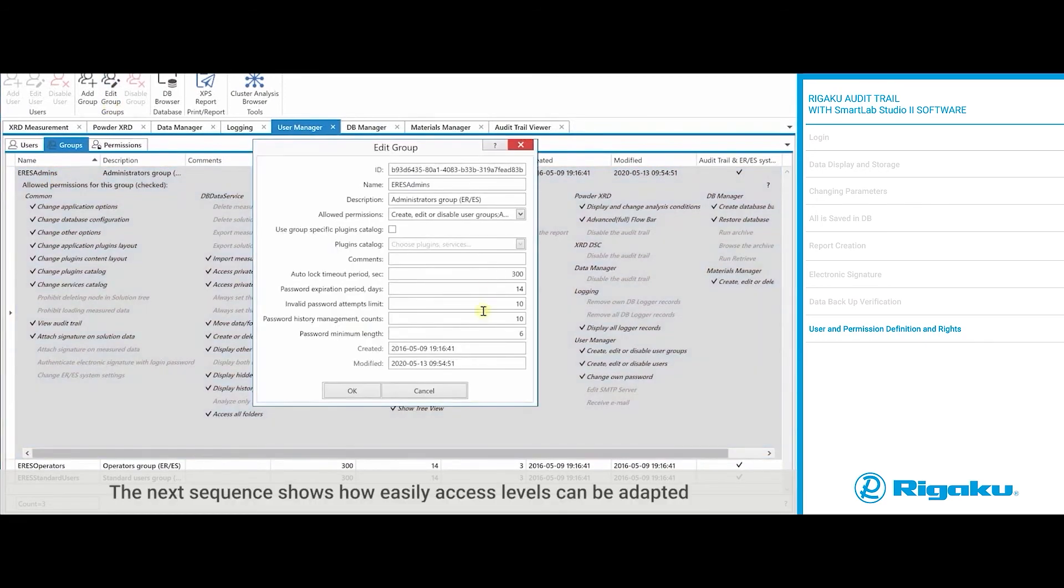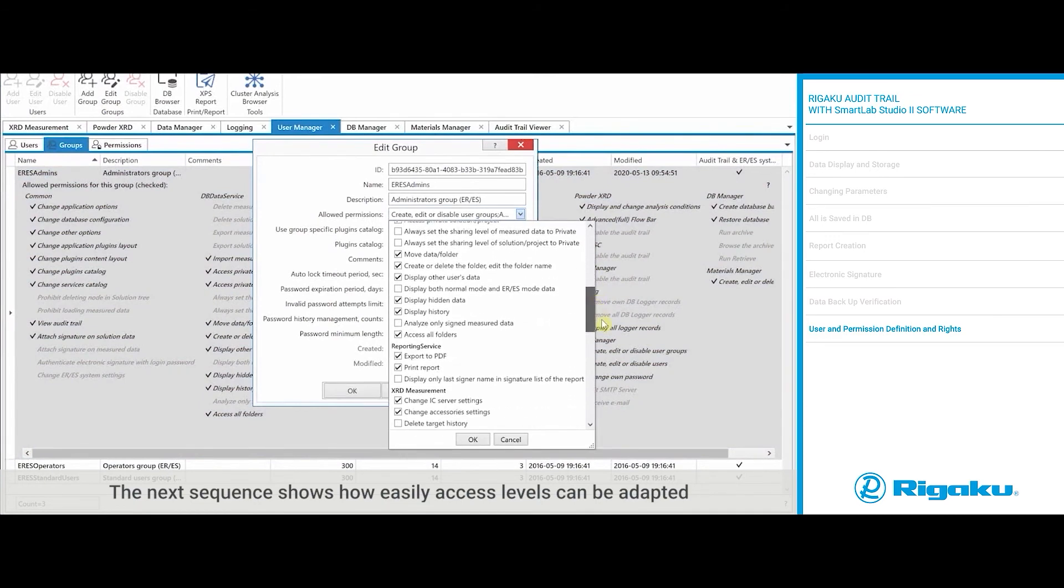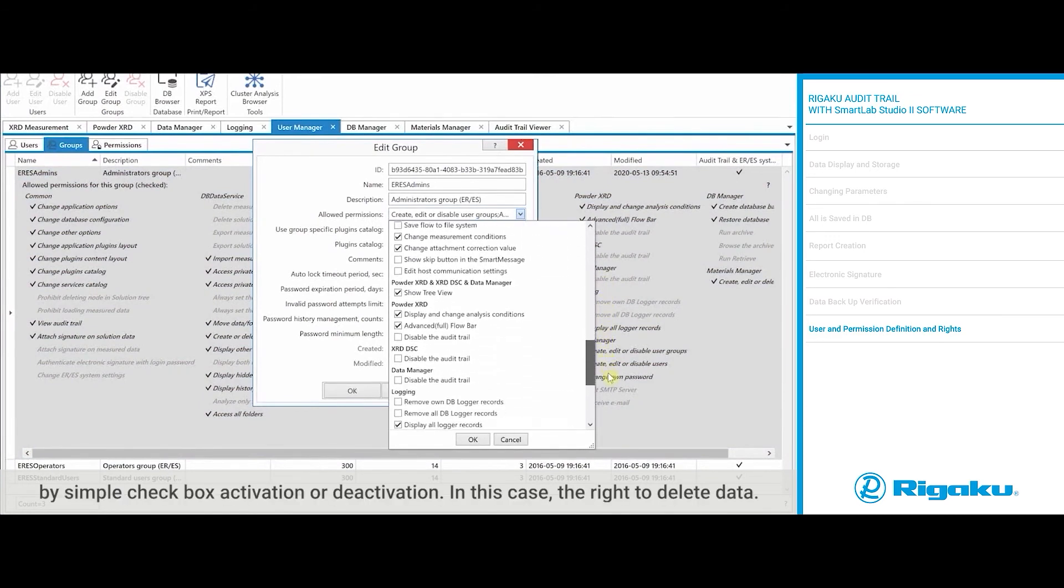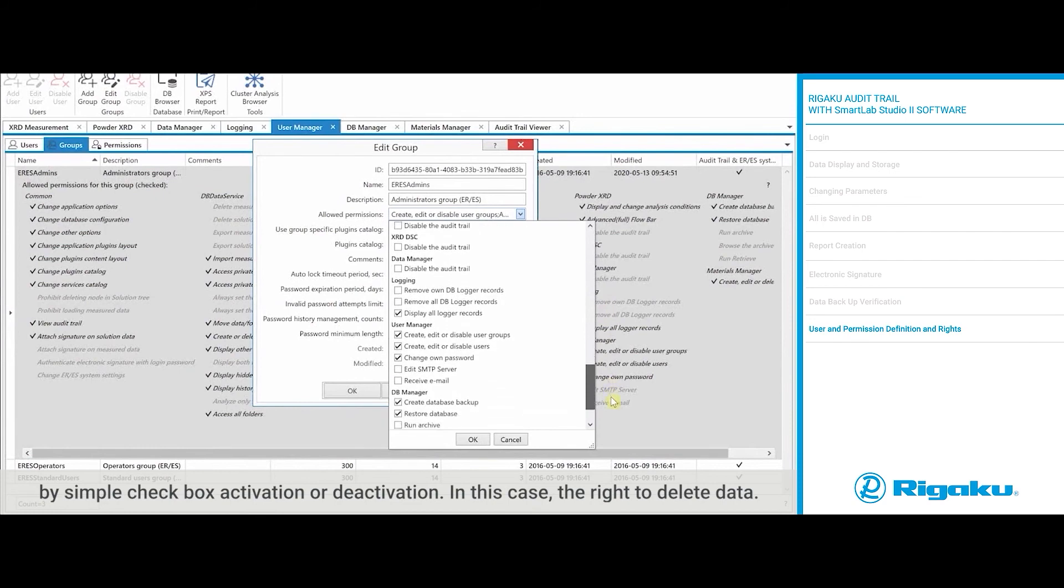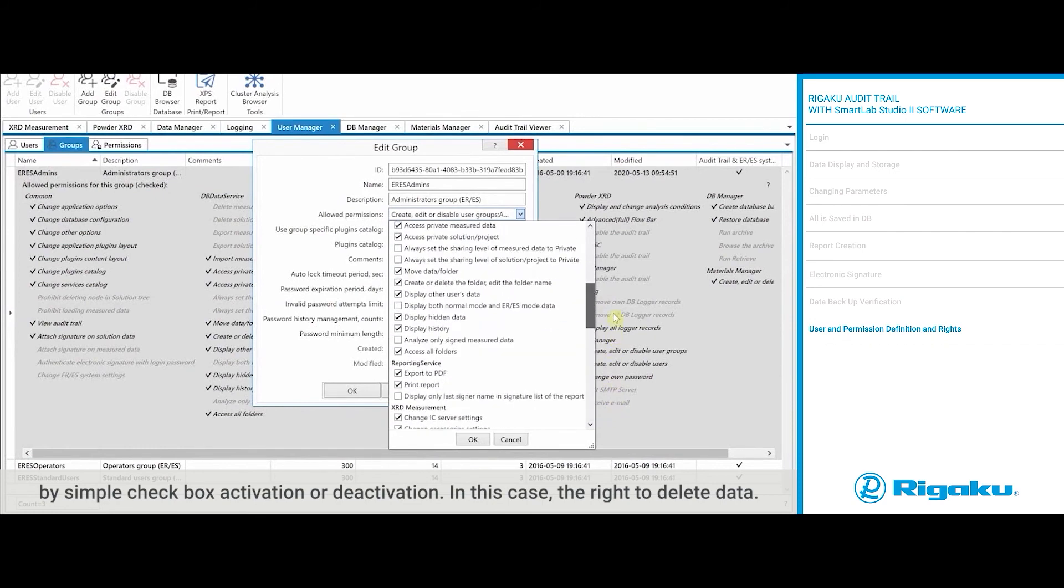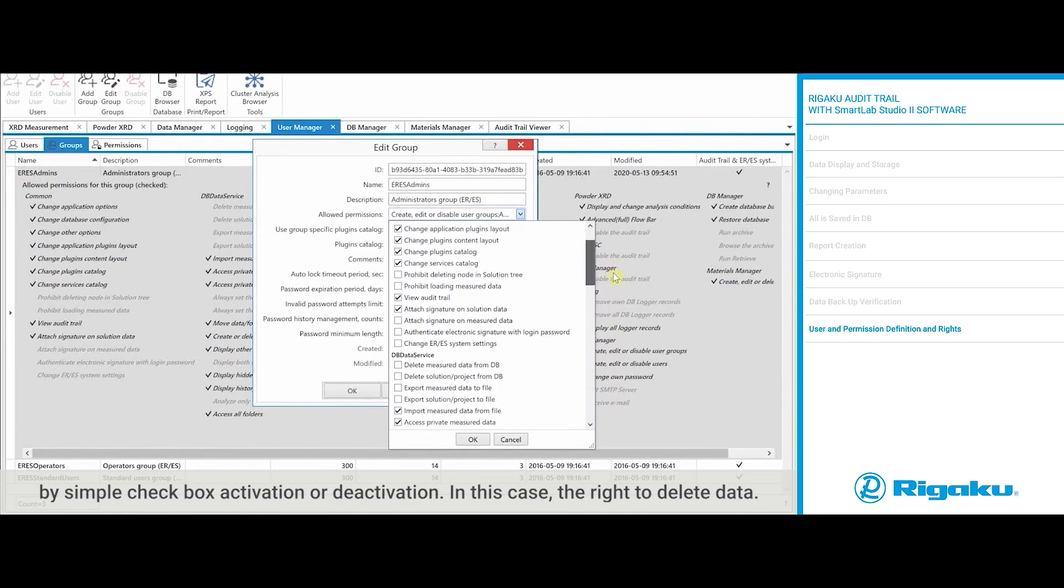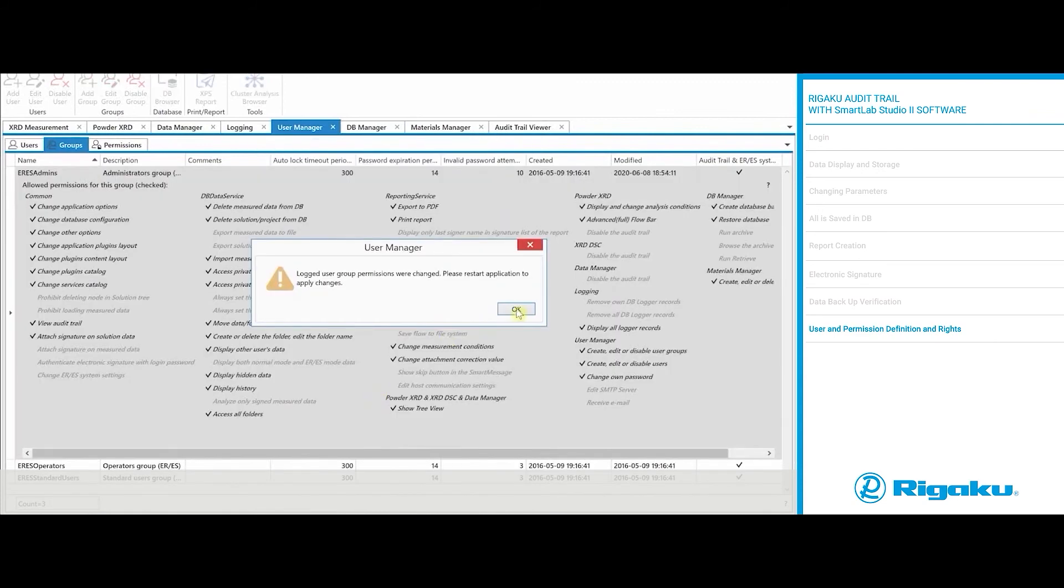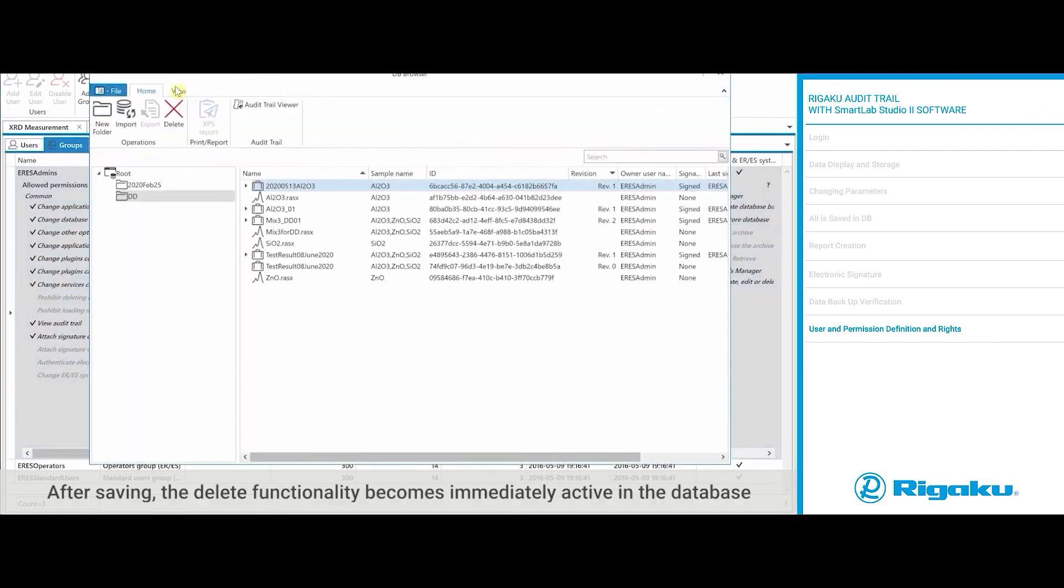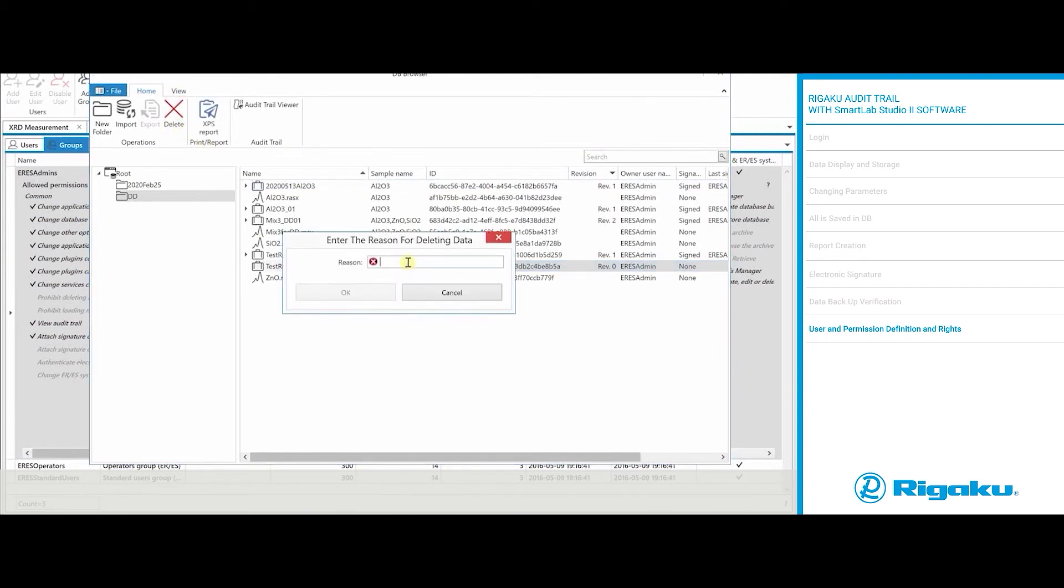The next sequence shows how easily access levels can be adapted by simple checkbox activation or deactivation. In this case, the right to delete data. After saving, the delete functionality becomes immediately active in the database and deletion becomes possible after a reason is entered.